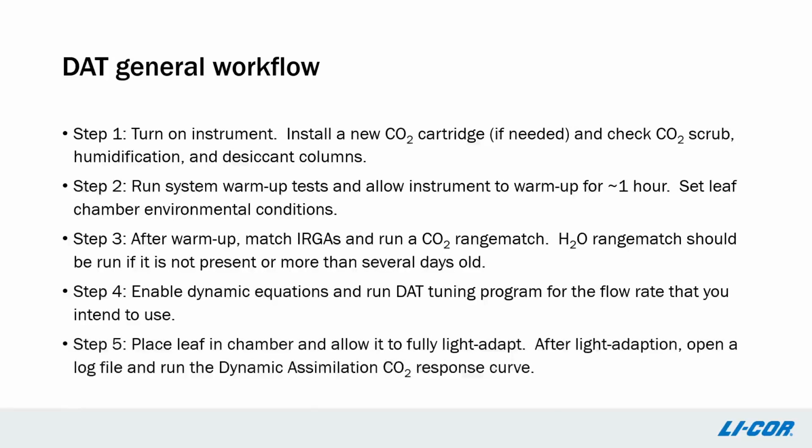Step 5. Place a leaf in the leaf cuvette and allow it to fully light adapt. Please note that the time it will take the leaf to light adapt will depend upon leaf biology and the prior light environment the leaf was experiencing. It will likely require experimentation to determine the light adaptation period for the species you are using. Once light adaptation is complete, open a log file and run the Dynamic Assimilation CO2 response curve.